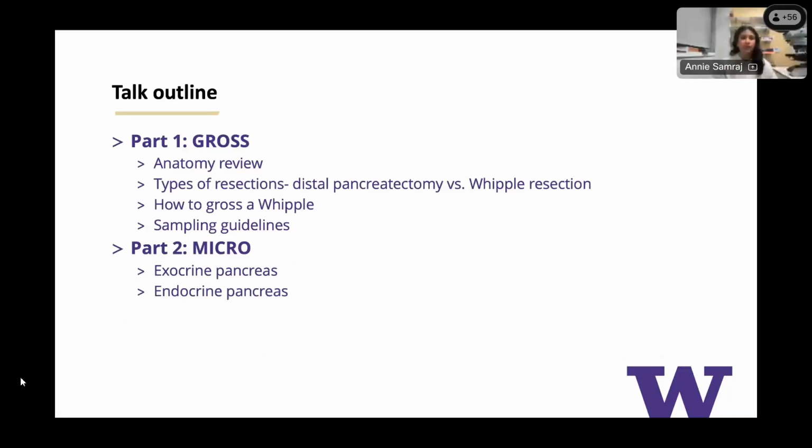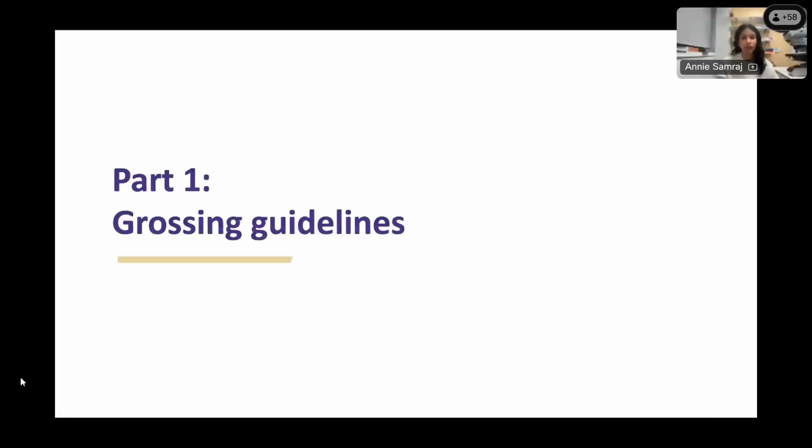I will also give you some sampling guidelines, and at the end of this first part, I would like to invite Dr. Munita to give us her perspective. Then we'll go on to part 2, which is the microscopic anatomy or the normal histology of the pancreas, and we'll talk about both components, the exocrine and the endocrine components.